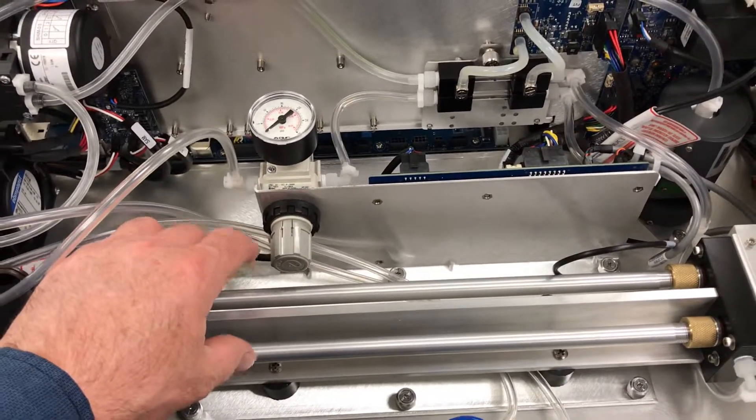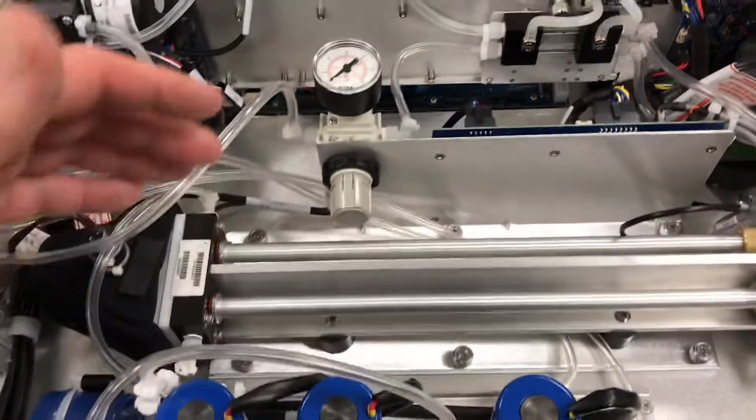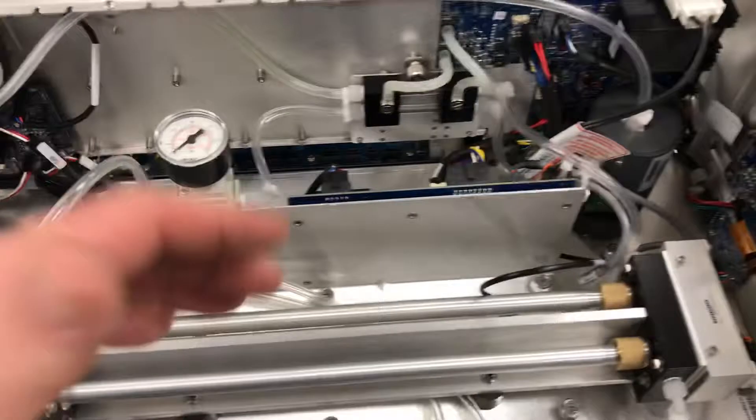They've got cell A and cell B centered on the instrument instead of being up tight to the side of the panel, and they're easy access as well.